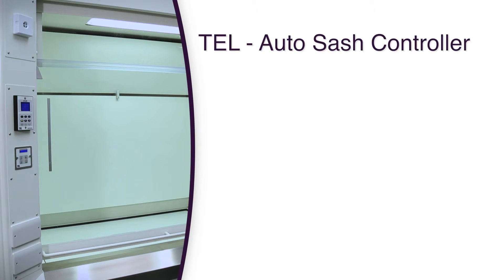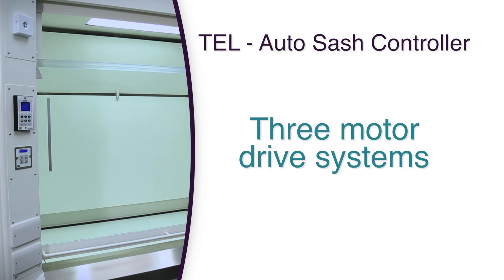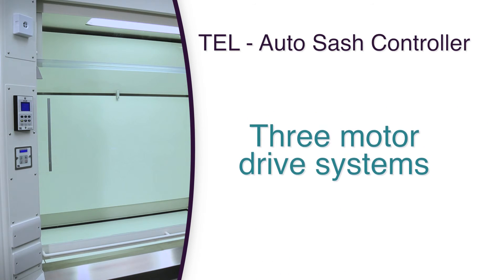TEL's auto sash controller will work with VAV fume hoods and also on CAV fume hoods and can be fitted new or existing with a choice of three motor drive systems to suit each type of fume hood.